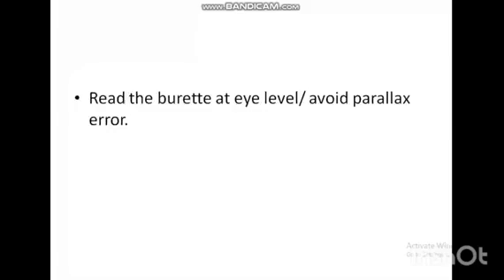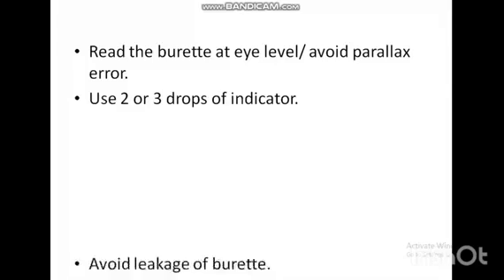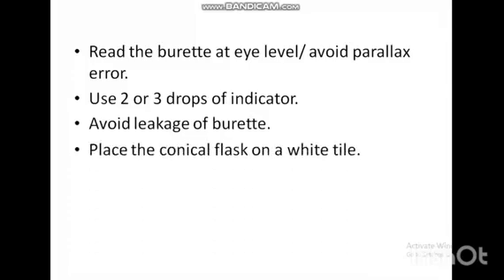Read the burette at eye level, or avoid parallax error. Use 2 or 3 drops of indicator. Avoid leakage of burette. Place the conical flask on a white tile or paper.